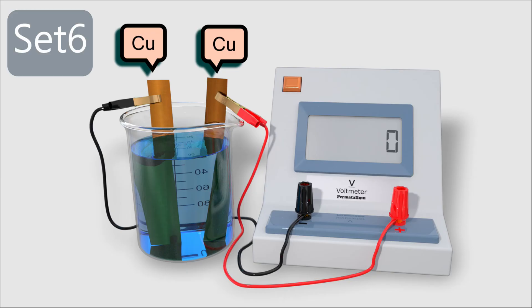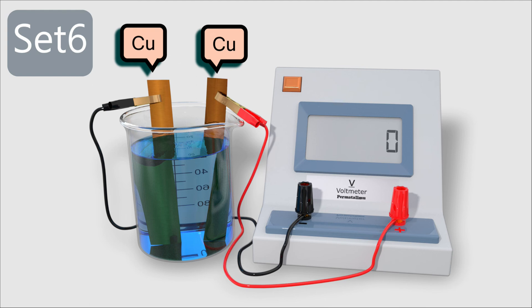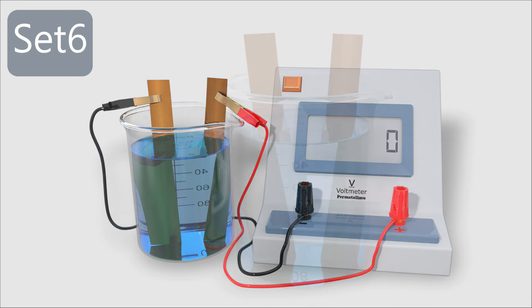For set six, two copper sheets are immersed into a copper(II) nitrate solution. When the circuit is complete, the voltmeter shows a voltage reading of 0V. No changes were observed.